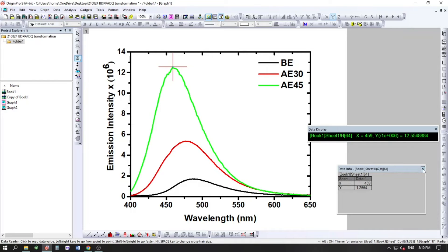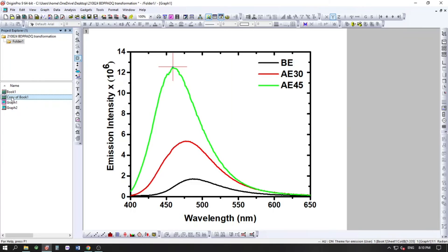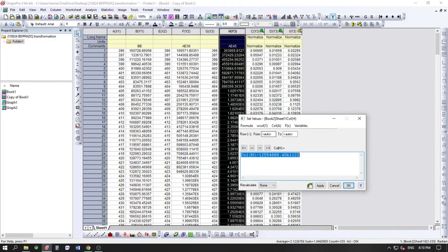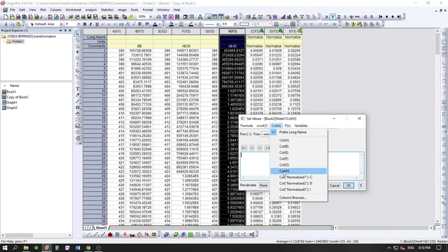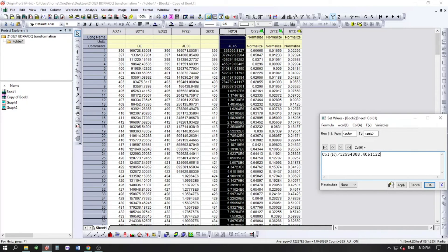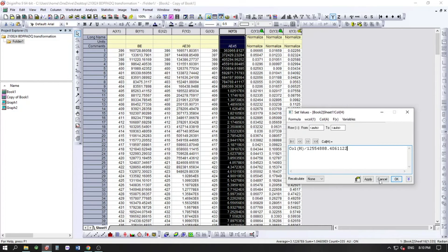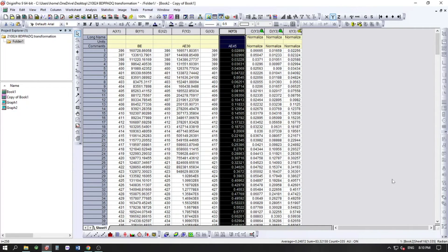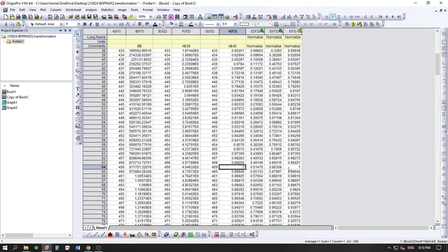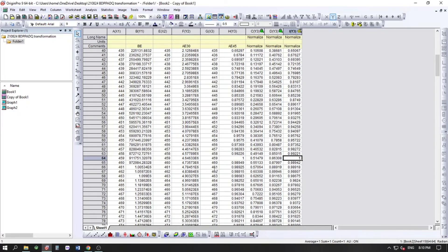For the first column, at wavelength 459 nm the maximum intensity value is 12.55. We will divide the entire column by this maximum value. Select the column, go to Set Column Values, and enter: column H = column H divided by 12.55. Click Apply. Now at 459 nm the value becomes 1, confirming correct normalization.